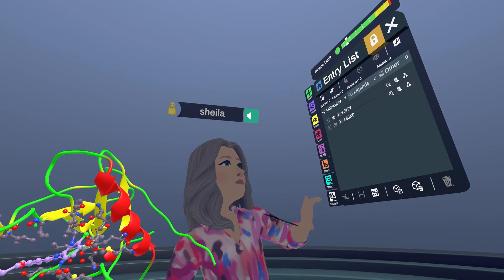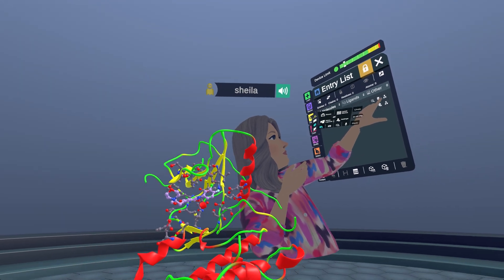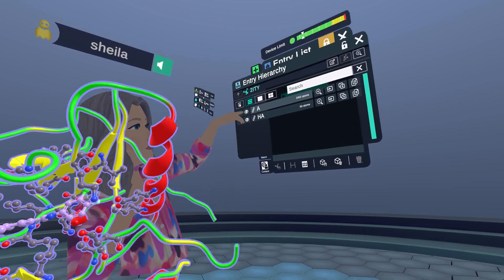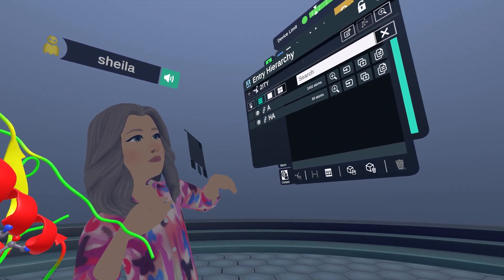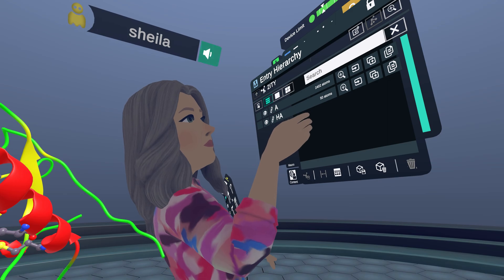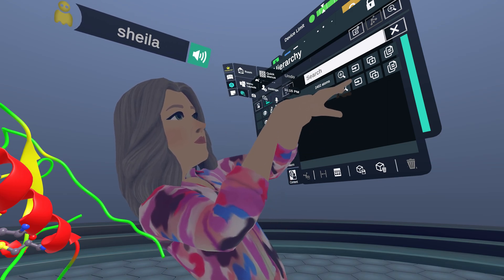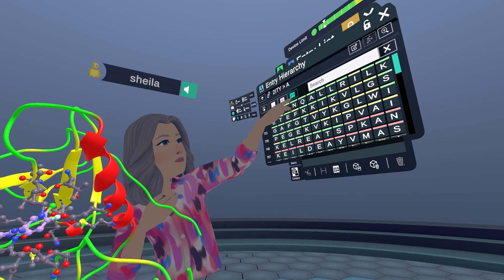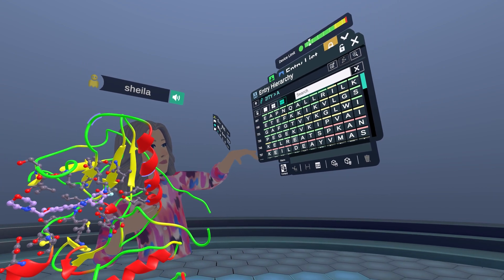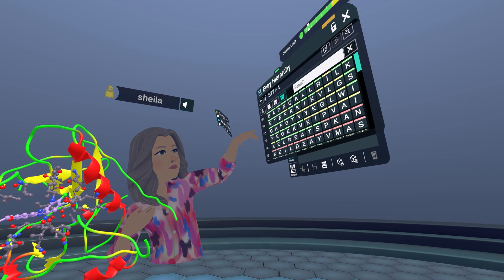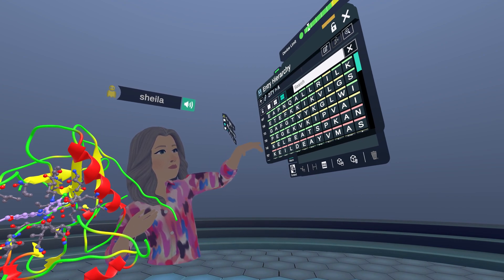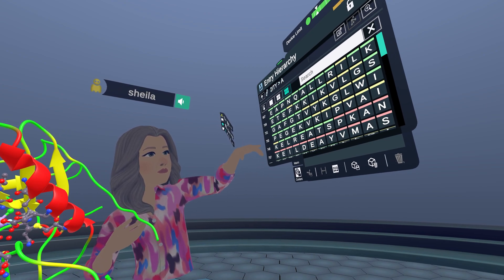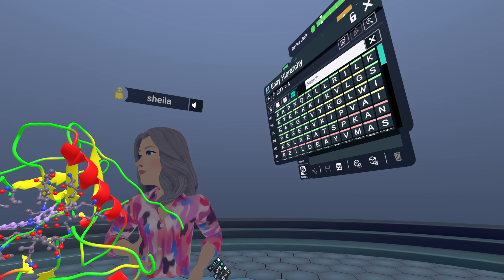Another way you can do this is through the entry list in the hierarchy menu. We can see chain A and the ligand here, and there's a hierarchy just for the protein chain. There are three modes to look at it. This is the abbreviated mode where it's just the single letter amino acid code, and each row has the starting amino acid number — 721, 733, 745, etc.